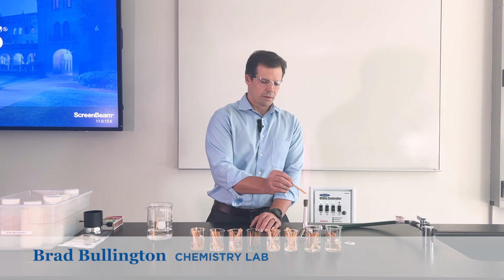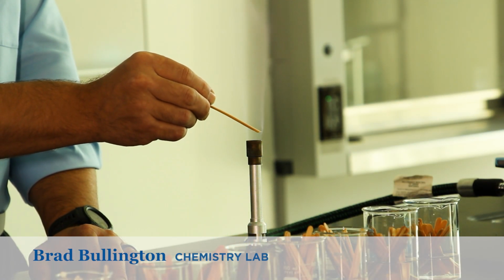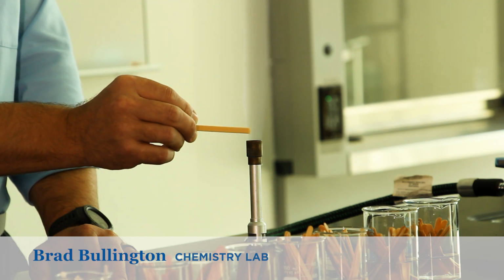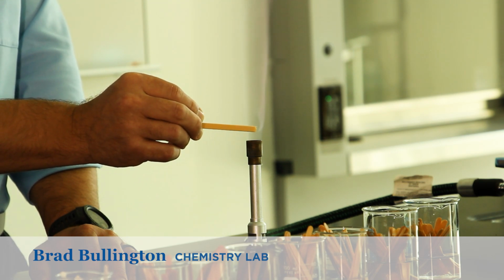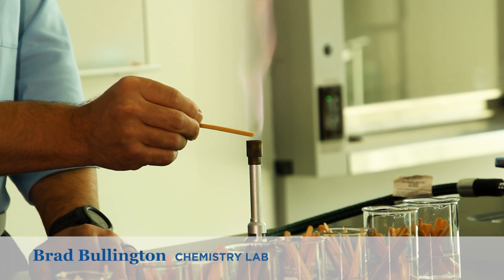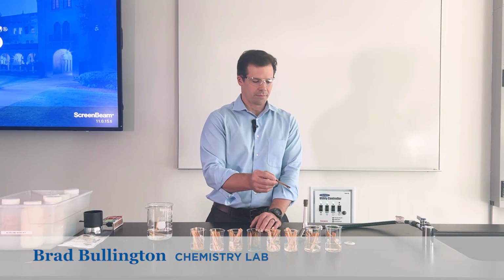Potassium. This one's very subtle. But it's a violet color. And this is the color exhibited from excited potassium electrons. The next is copper.